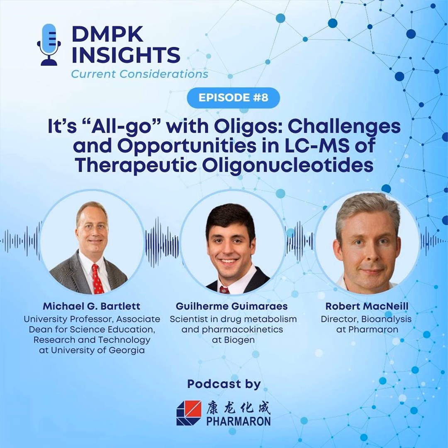There was a time when people didn't believe 2 mm columns were robust enough to be used chromatographically, or even 1 mm columns. And I think as the manufacturing got better, we were able to overcome that as more people used them, became comfortable with them, and the volume of manufacturing of them increased. I think we're going to have to go through the same growth pains here as well. But I do certainly think that we'll gravitate to microflow LC pretty quickly. I think the robustness is going to be there at that level.